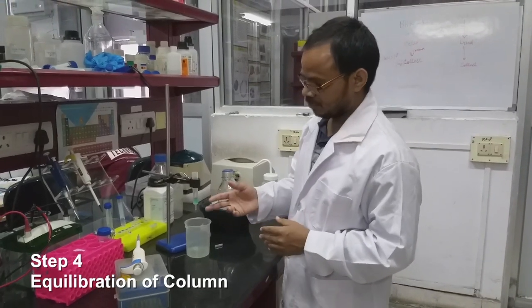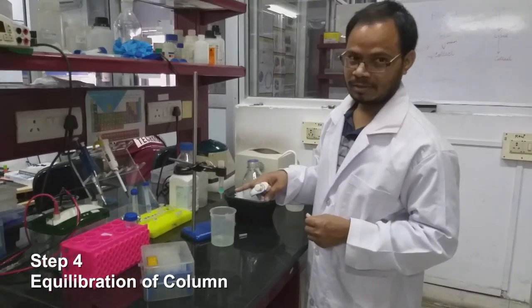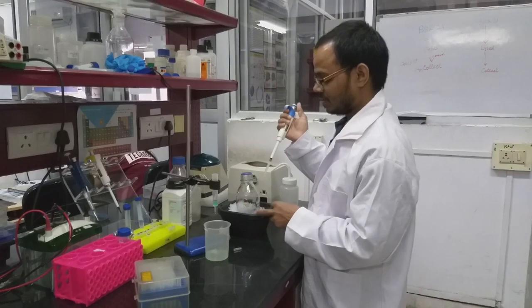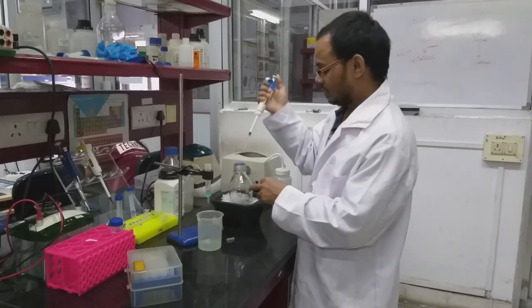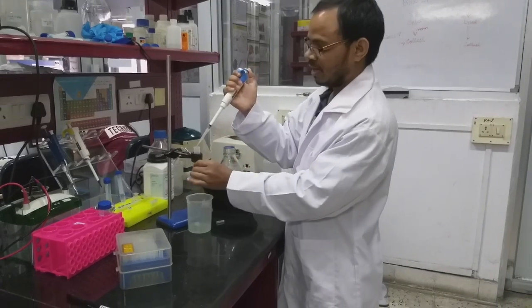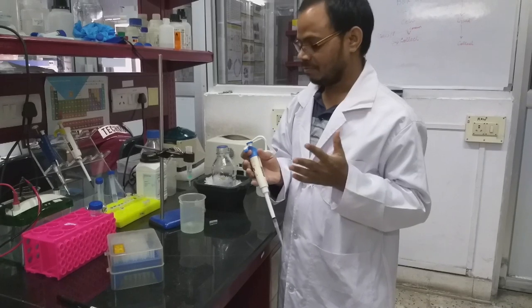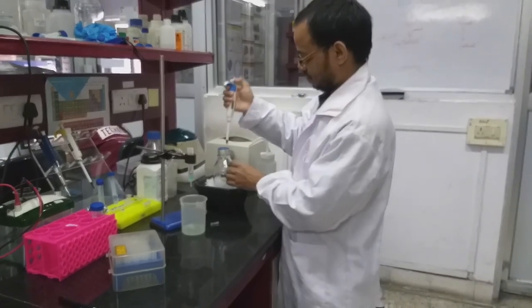So after 20 minutes we eluted the nickel solution. Next we will equilibrate with the lysis buffer. We have to wash at least 2 column volumes to remove any free nickel which exists in the beads.